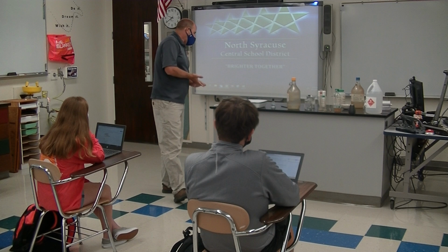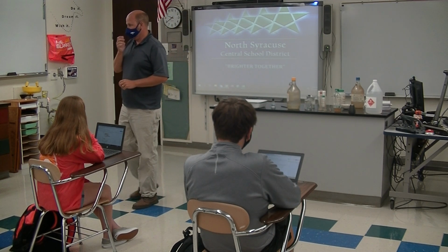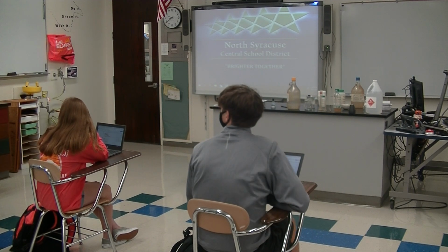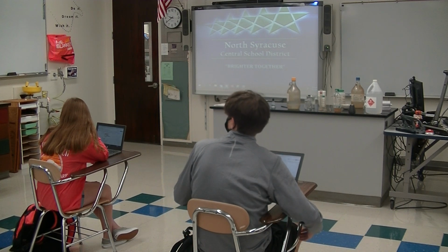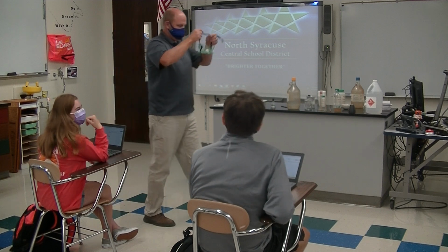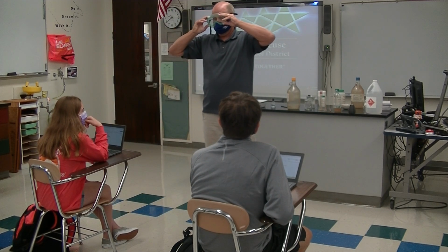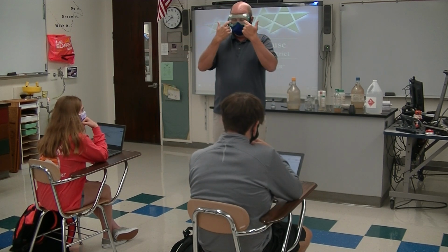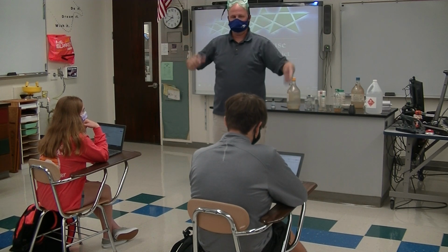All right, eyes. What do you do if you get acid or something in your eyes? Now we're going to use something to prevent getting stuff in our eyes. We're going to use these very stylish goggles. These are the goggles that they say that you have to wear according to New York State. So with your mask and goggles, you're pretty much covered. All right, these goggles prevent things from getting in your eyes, but let's say something does get into your eyes. What do you have to do?